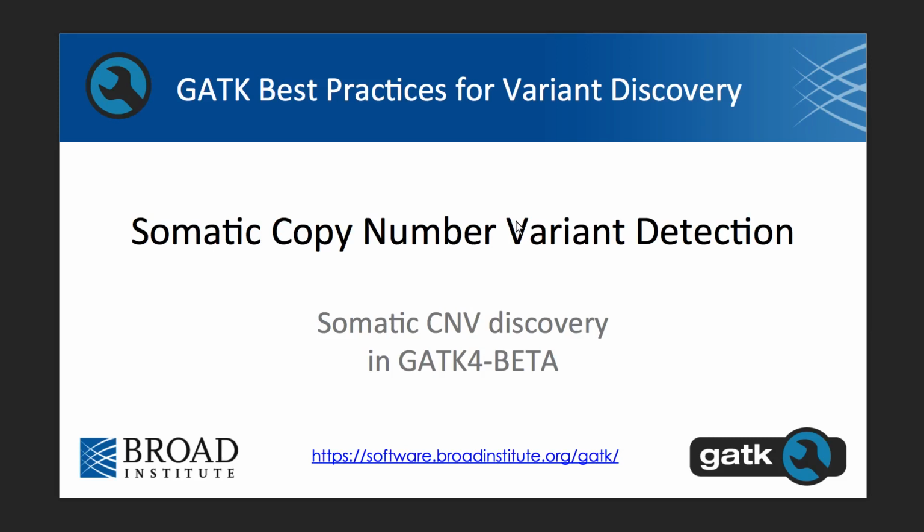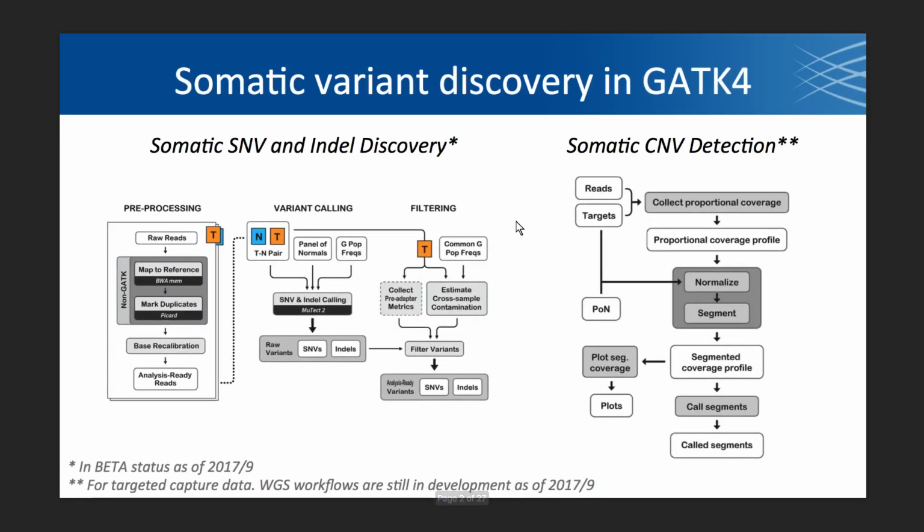All right. So here in the CNV workflow, you see many components. They are modular. In white, we have inputs and output files. In gray, we have functionalities that are handled by the tools. And here we have boxed two of the functionalities because this is what lies at the heart of our CNV workflow.